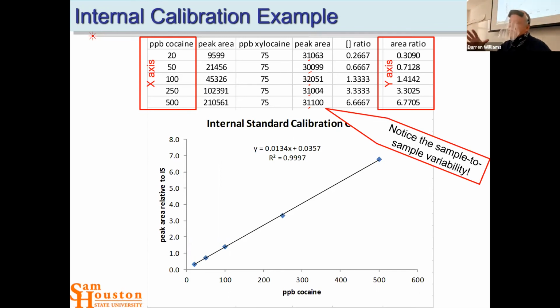Now, most of our injectors in commercial labs are auto injectors. And so the little robot comes and puts the vial in there, and this auto sampler grabs the syringe and goes and injects it in the instrument. And that has improved this precision greatly, because the hand injection was one of the largest sources of error or uncertainty or precision problems in these analyses.